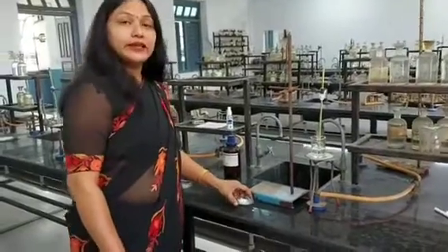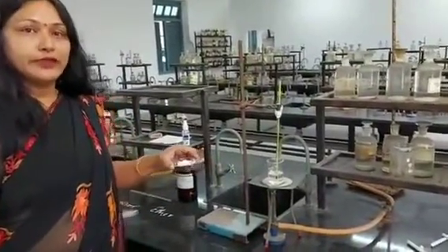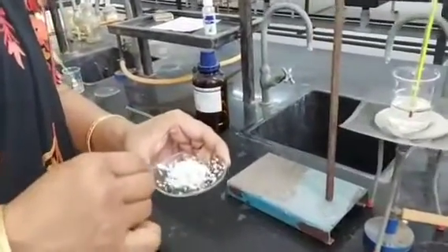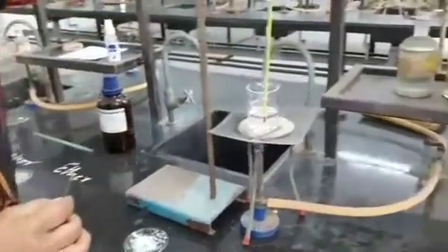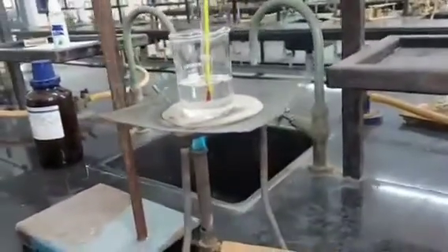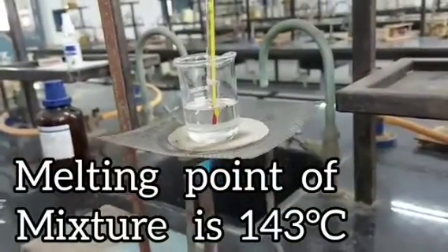So after determining the melting point of pure camphor, we are going to determine the melting point of the solution of camphor and the given solute. So this is the mixture of camphor and the solute after evaporation of ether. So we have taken this mixture again in a capillary tube, and we are determining the melting point of the mixture using the melting point apparatus. And finally, we obtained the melting point of this mixture to be 143 degrees Celsius.